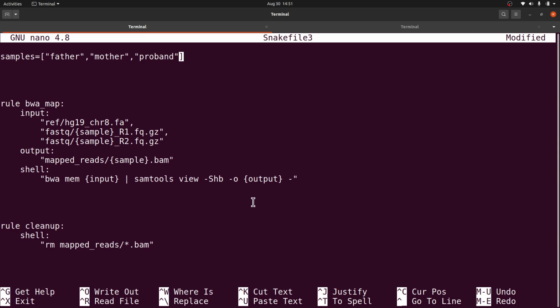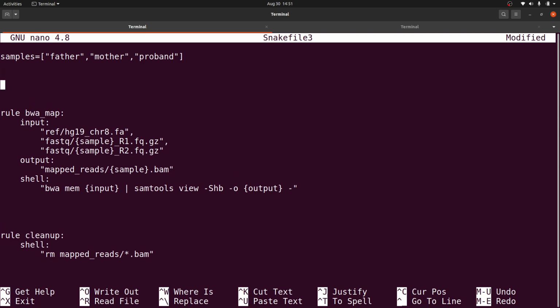So we will add another rule, which is rule all. Okay, so rule all, this will be executed first. All right, so this is the rule. I also want you to type rule, and then all, and then bring your colon. If you have a situation like this, we use the expand function, or the expand utility, if you also call it that way, to get all the input for us.